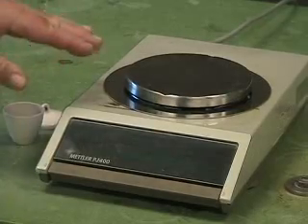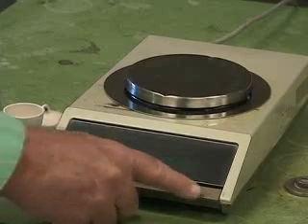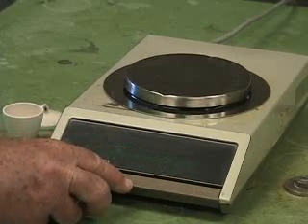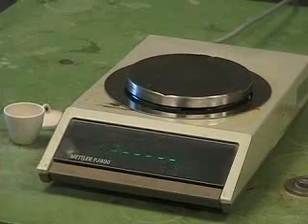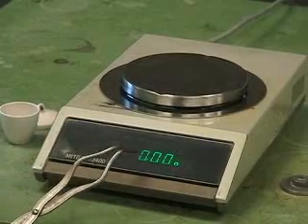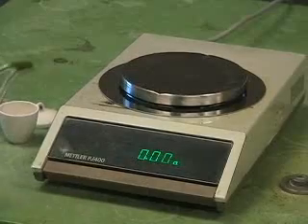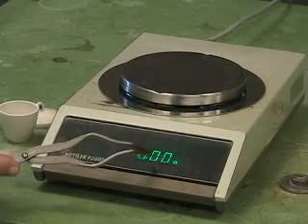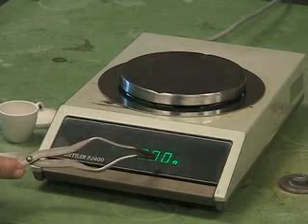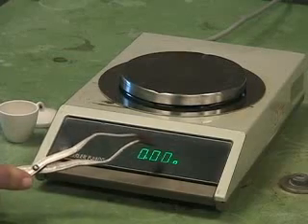This is a top loading digital balance. We turn it on by pushing down on the front bar — at least this model, this is the way you do it. You wait a few seconds and it should come up to read 0.00 grams. This is a centigram balance, so the last digit that it shows is in the hundredth of a gram unit, and therefore we call this a centigram balance.